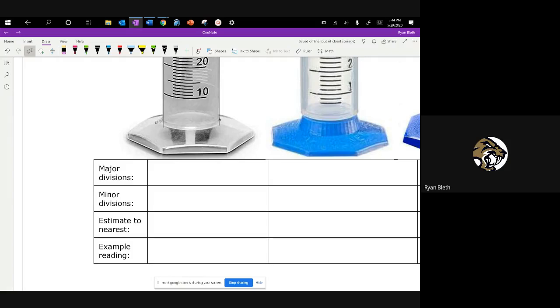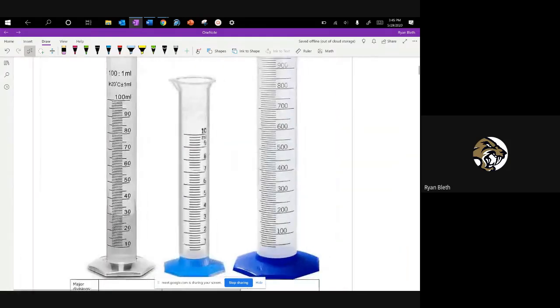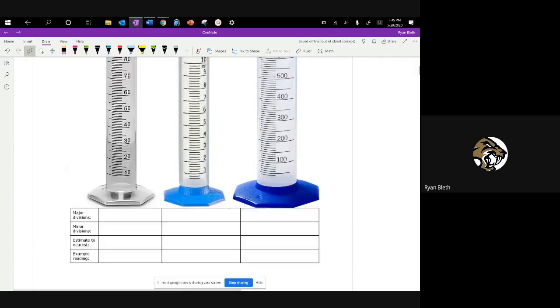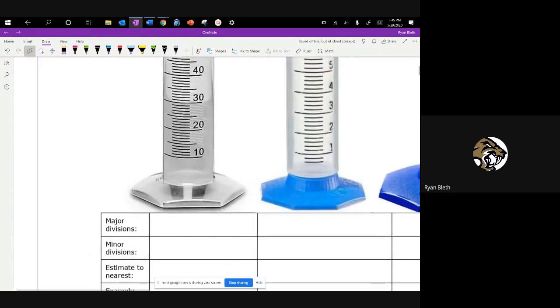So on this first device, we call this a graduated cylinder. It's a cylinder in shape and it has graduations — little lines marked on there to tell you exactly what the quantity of liquid in there would be. The major divisions here are by 10s, so we have major divisions to the nearest 10: 10, 20, they're marked by 10s.